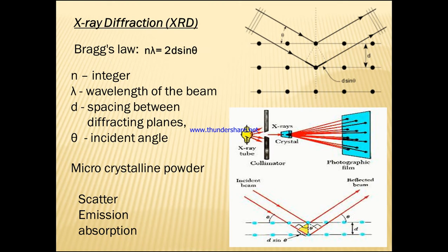Bragg's law is named after the scientist William Bragg; father and son both discovered Bragg's law as well as the XRD technique. For this they received the Nobel Prize. Both the father and the son did the research on this, and they came up with X-ray diffractometry.